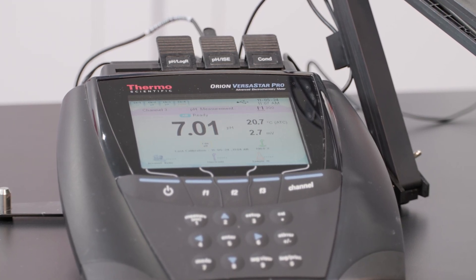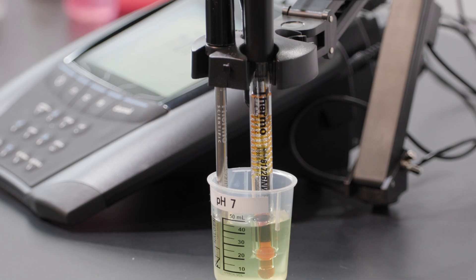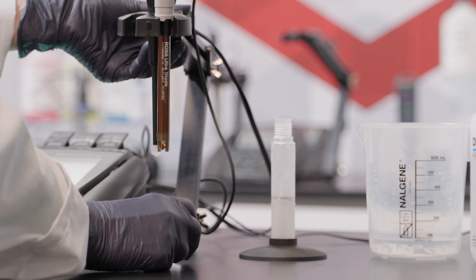Are your results accurate, reproducible, and reliable? Does the electrode respond quickly and calibrate easily? Does it last as long as expected?